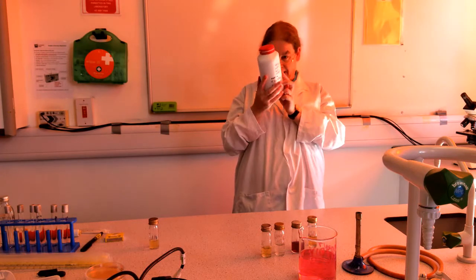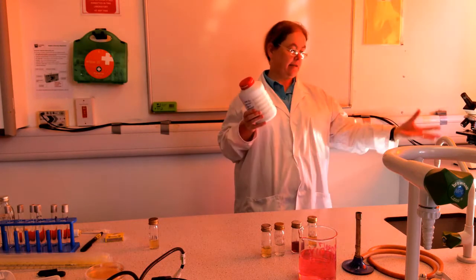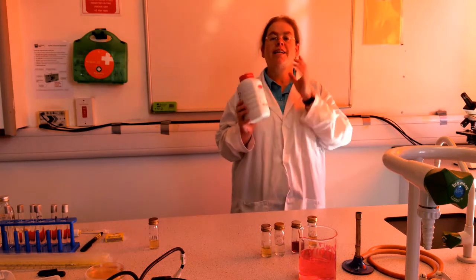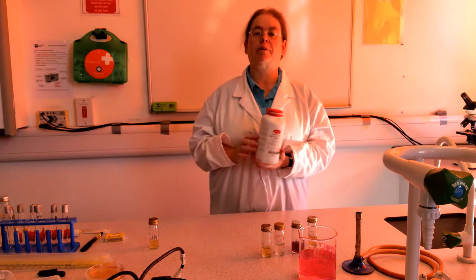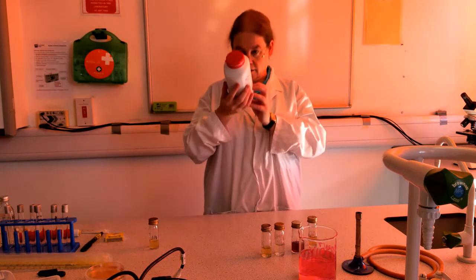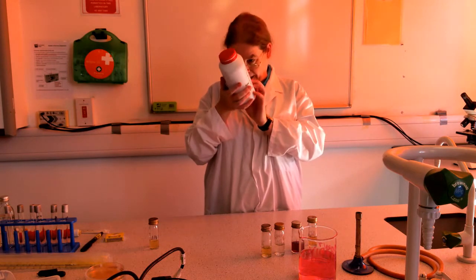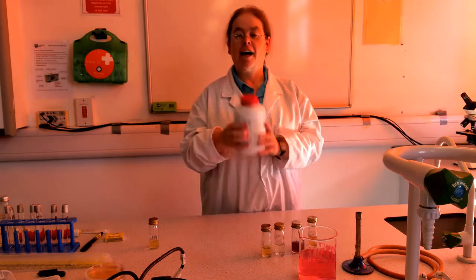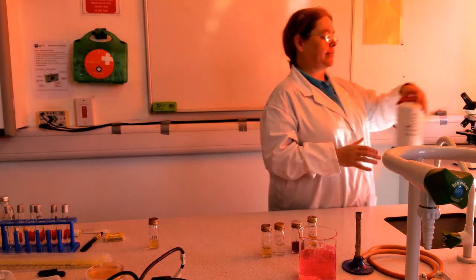As well as that, it's got the basics of nutrient broth. But the important thing is the bile salts, which kill most bacteria that don't naturally live in the gut, and this dye, whose name I can never remember, bromocresol purple, says so right here, which will kill most gram-positive bacteria.